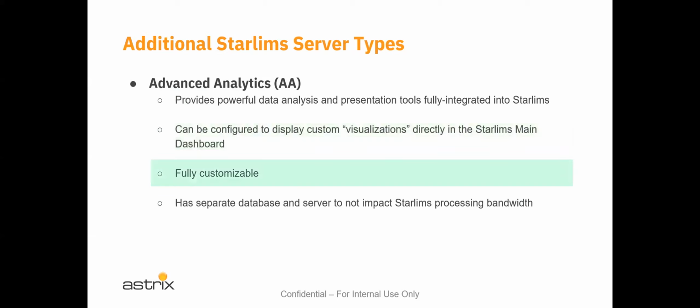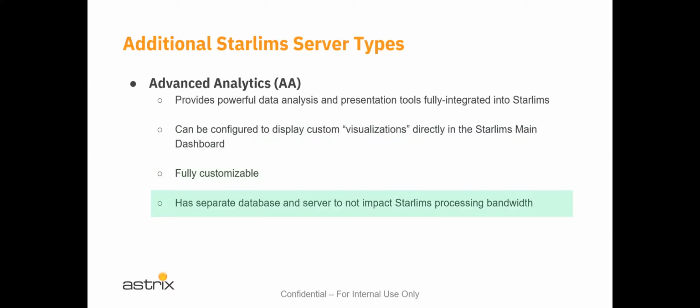So you can create any sort of different types of visualizations right in the center dashboard of the STARLIMS system. And that is affected by a design system. It's a separate application that is used to access the advanced analytics server, which connects to the STARLIMS data, allowing a fully customizable and designable environment. It has its own separate database and server, so it doesn't impact the STARLIMS processing bandwidth.